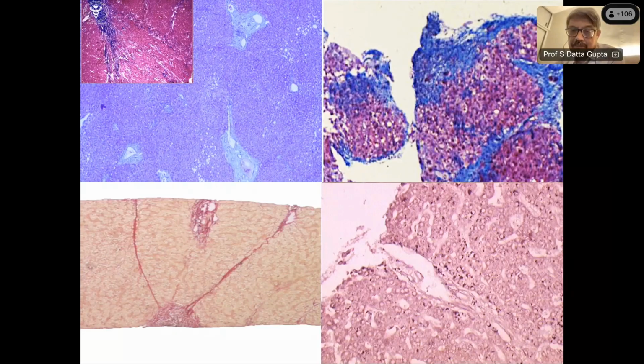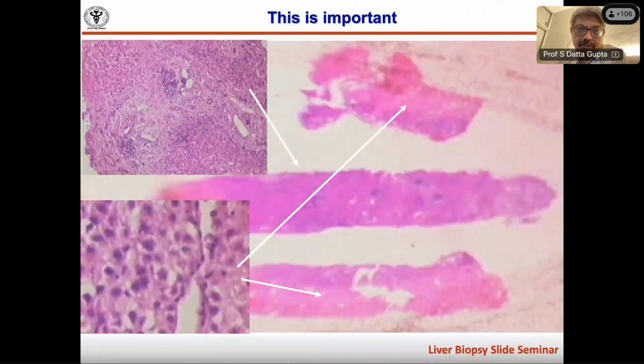So you get increased copper and copper associated protein. It stains copper associated or copper binding protein. It doesn't stain copper. Copper is stained by rhodanine. So this in biliary obstruction you will get. In Wilson's disease, of course, that's a separate disease, there also you get an increase in this copper associated protein. So these are the stains that you do normally.